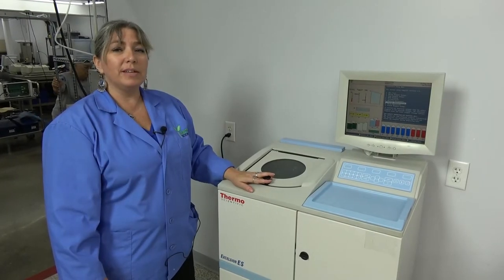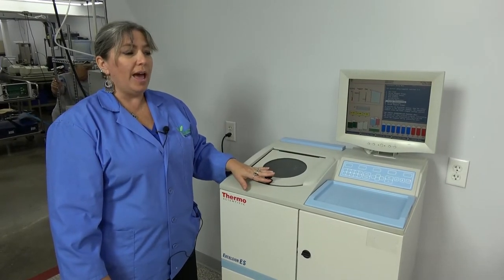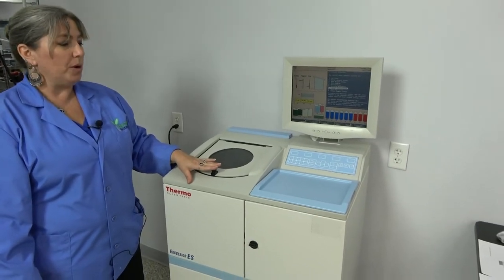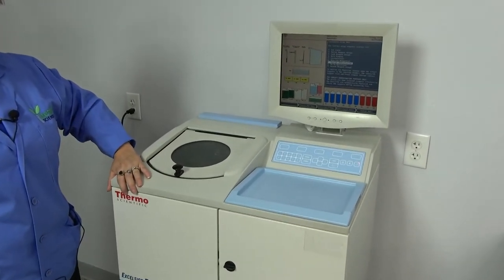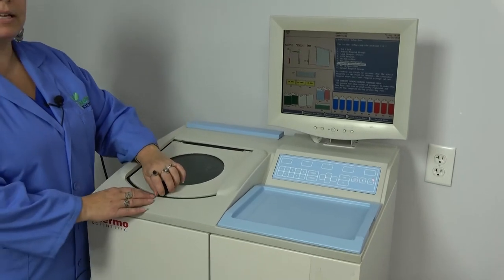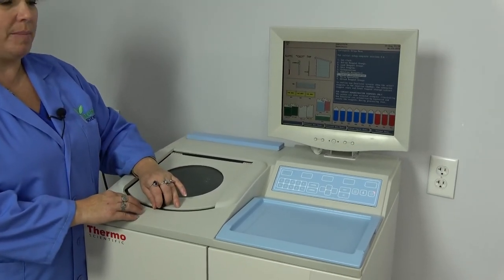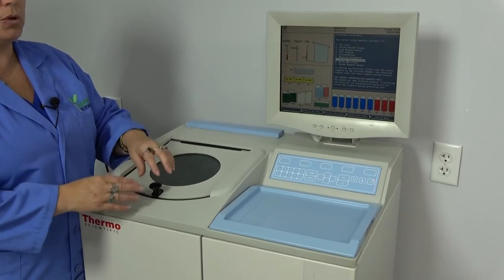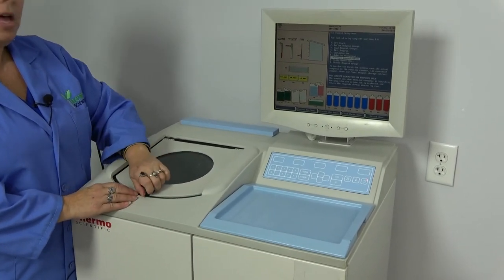Hi, I'm Lori and today at New Life Scientific we're going to take a look at the Excelsior ES. This is a tissue processor made by Thermo Scientific. It drastically cuts down on the time involved in the highly detailed process of preserving and embedding tissue samples.